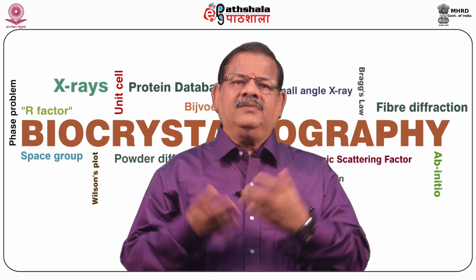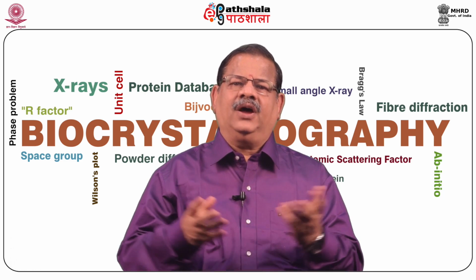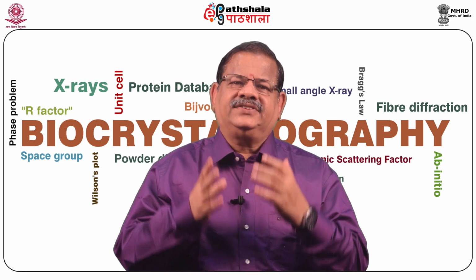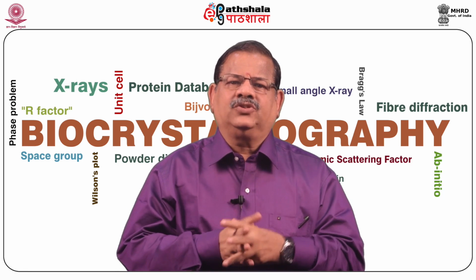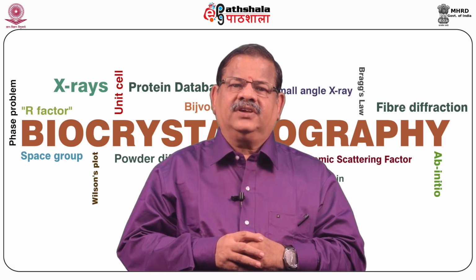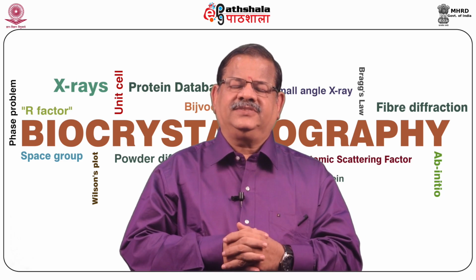CCP4. What do you mean by CCP4? It means Collaborative Computational Project number 4. It's a free software. Anybody can download it into the computer and use it. It's user-friendly. And this is a program suite which is an integration of a set of programs in protein crystallography written by many scientists, and which includes a large number of very useful tools developed by these scientists around the world. The programs which are available as supporting modules in CCP4 are listed below with the name and the purpose for which each program is useful.